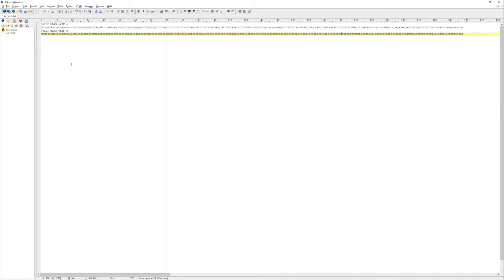So now this here is an exact match of what our consensus should be. It's basically we've used the part of 2 reads to combine to make the consensus.